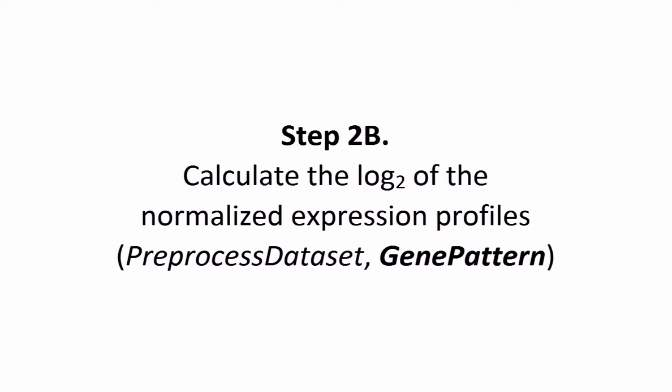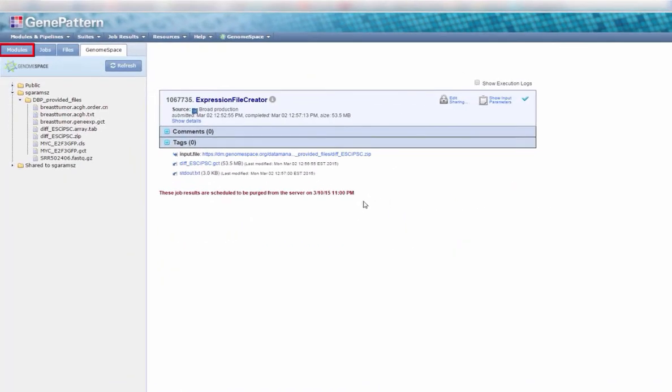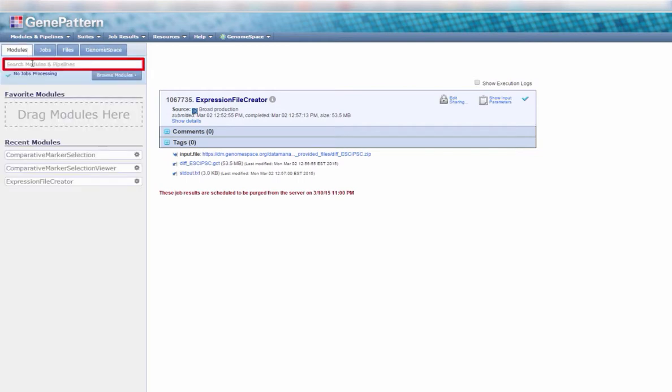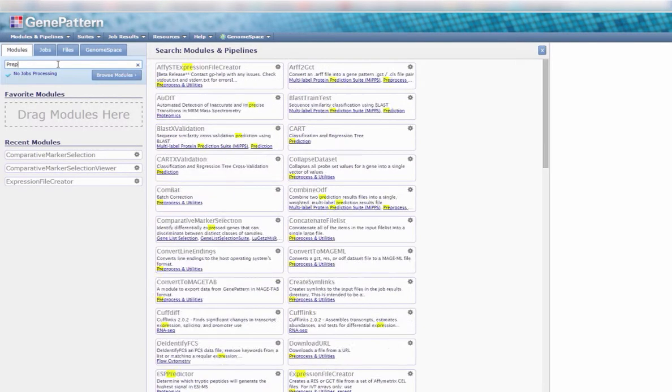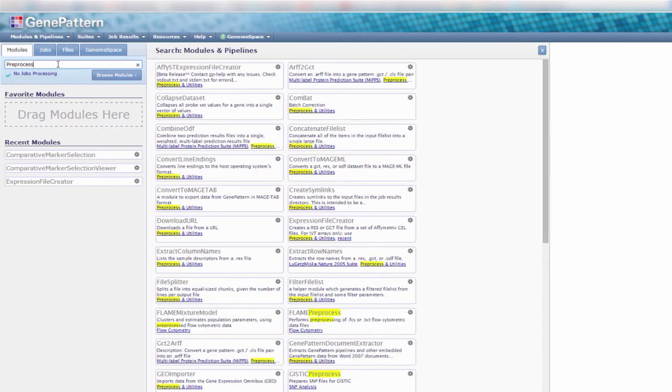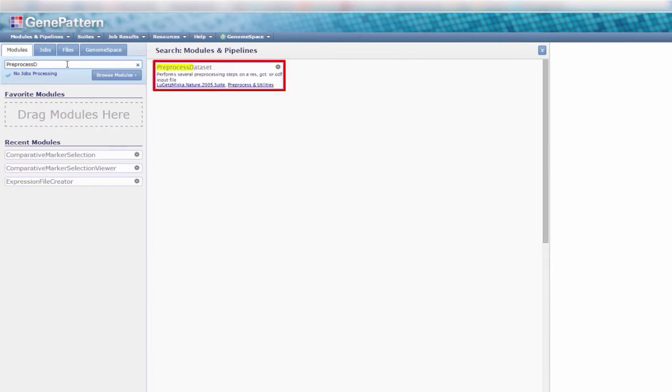Step 2b. Next, we calculate the log of the normalized expression profiles using the PreprocessDataset module in GenePattern. In the Modules tab, either search or browse for the module PreprocessDataset and select it from the slide-out menu.